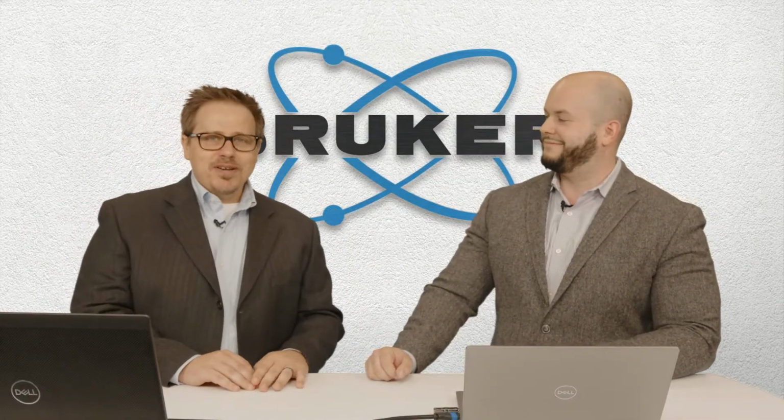So I'm joined today by my colleague Jonathan. John, thanks for having me on. Pleasure to be here. All right, so today's topic, orientation analysis.